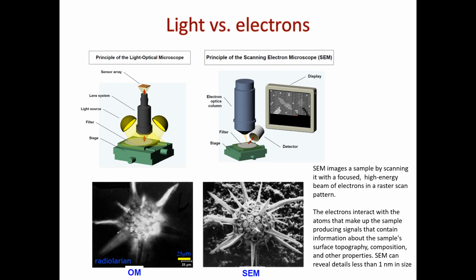But if I need technical information in porous media, because of all these surfaces, and I'm actually interested in the porous spaces within this, which is what we are after, then it's extremely hard to use unless you figure out a way for some of it to be transparent. So that's something to think about.